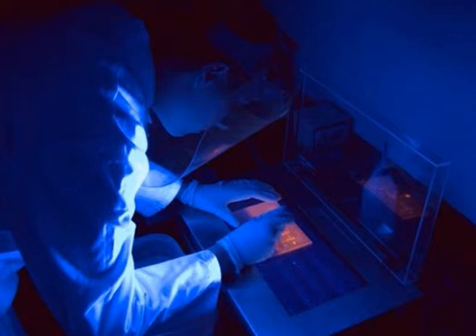The results thereby obtained can be quantitatively analyzed by the visualization of the gel with UV light and gel imaging devices. The image obtained from this step is recorded with a computer operated camera, and the intensity of the band or the spot of interest is measured and compared against the standard or markers loaded on the same gel.